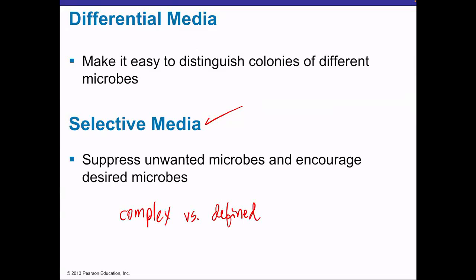A defined medium is a medium in which all the molecules included in the medium are known. Now, if we are talking about a complex medium, this medium includes at least one complex ingredient, and for this reason, the exact chemical constitution is not known.